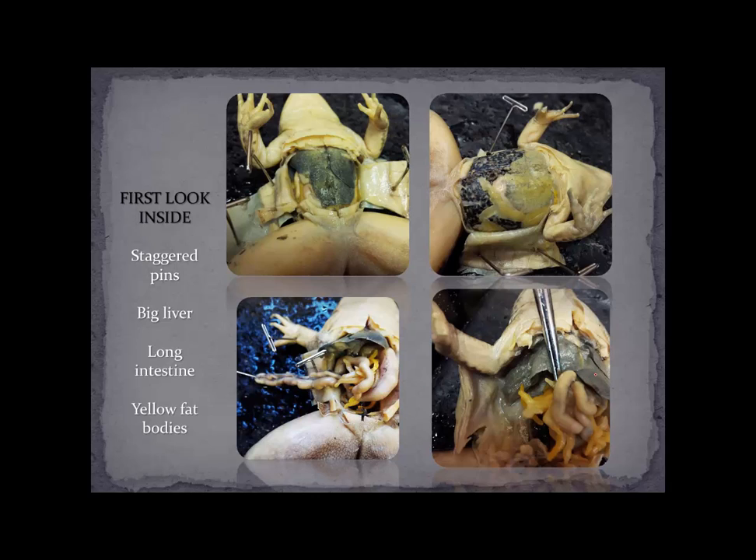Once again, we have the liver here — all of this grayish-green thing. This organ, which is inferior to the liver towards the dorsal side towards the back, is a lung right there. The other thing you're going to notice very prominently are all these yellow finger-like things coming out — these are the fat bodies. They store energy and help insulate some of the organs. All of this is fat body; you can see some over here and all these little stringy things are fat bodies.